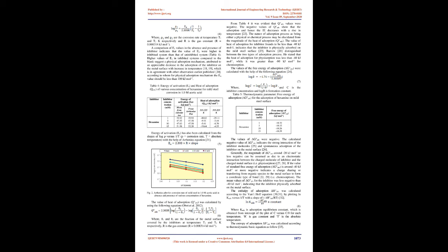B. Weight loss measurement. For weight loss measurement, the MS specimens were each completely suspended in 230 ml of 0.5, 1.0, 1.5, and 2.0 M acetic acid solution in a beaker of volume 250 ml, with and without hexamine as inhibitor having concentration of 1, 5, 10, and 15 mM at room temperature of 303 K, for 24 hours. C. Surface cleaning of test specimens. After the exposure period, to remove the rust the MS test specimens were cleaned with Clarke's solution, followed by distilled water, then washed with acetone and dried with an air dryer. From the weight loss data, corrosion rate, CR, was calculated.